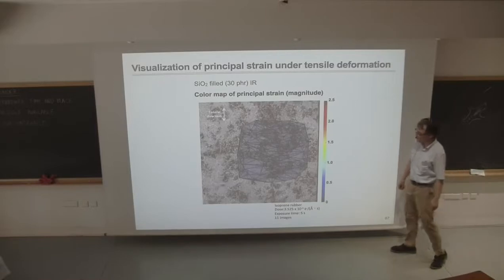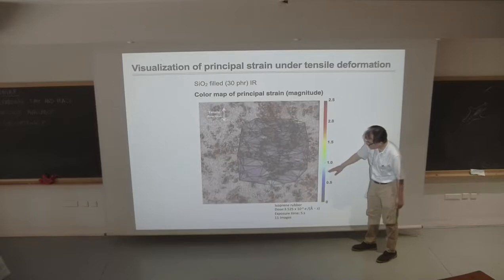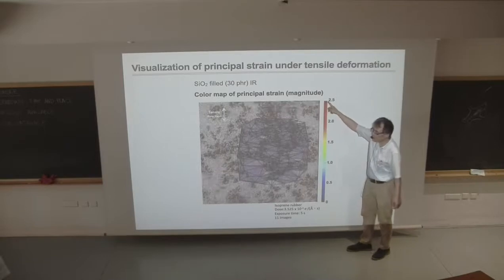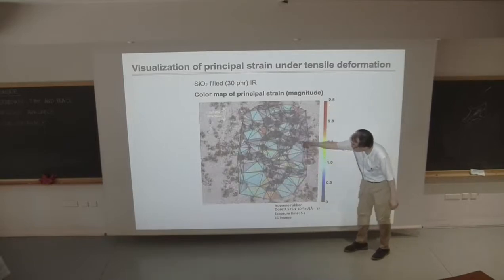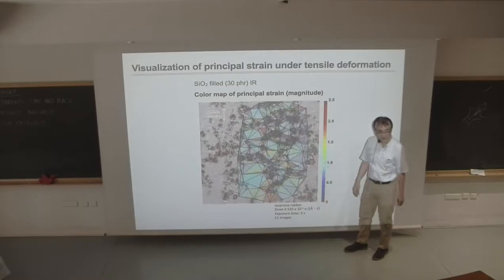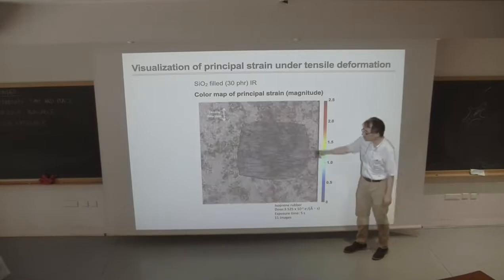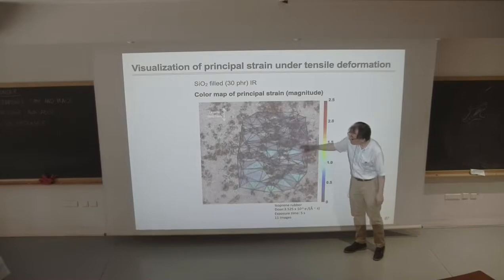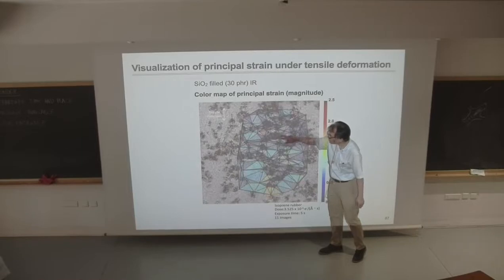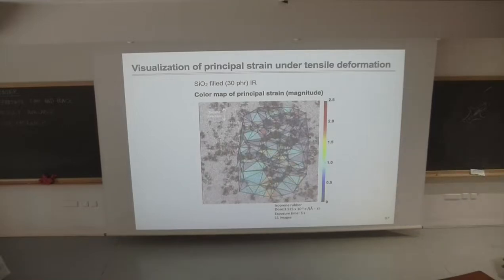Okay. So the global strain is up to 0.73, but as you can see, the red part somewhere here is over 2.5, and there are some places where the strain is essentially 0, and the part where the strain is 0 is the aggregate position, and those red parts are often between the aggregates. So it's difficult to see now.